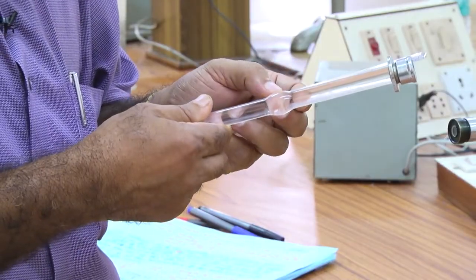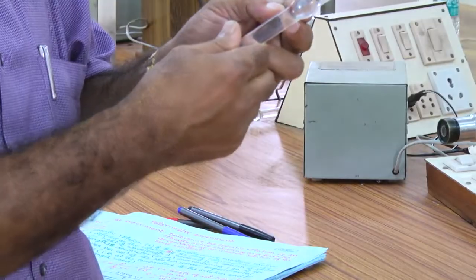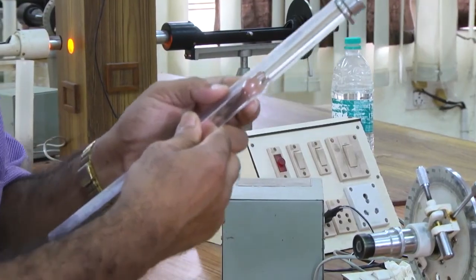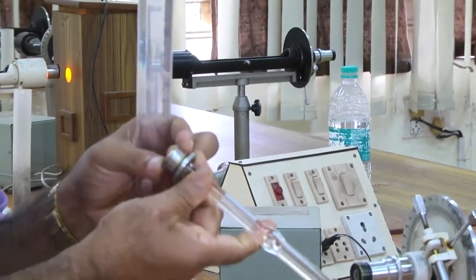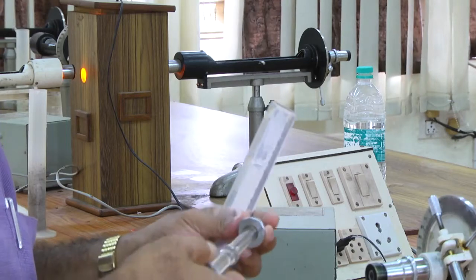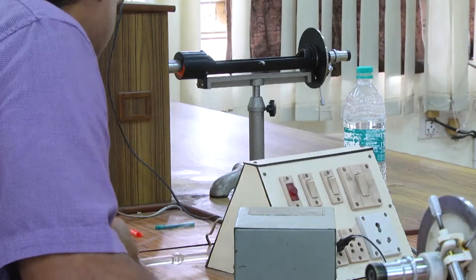If I put 0, in this case I am getting reading 18, but water is up to this. One has to open it and see before putting water.